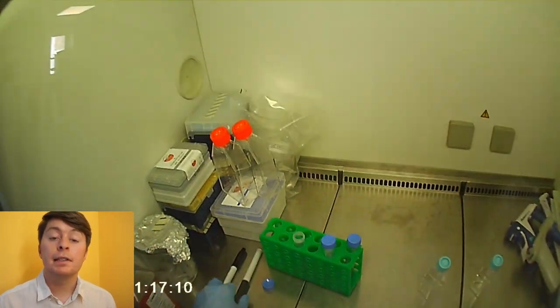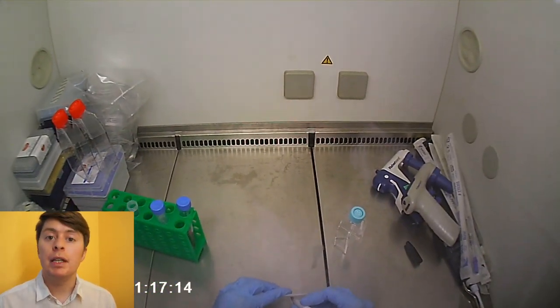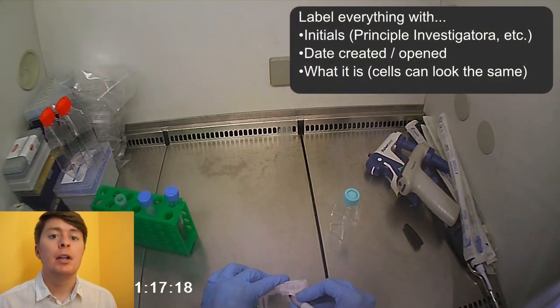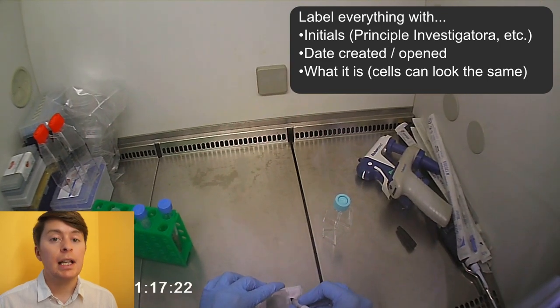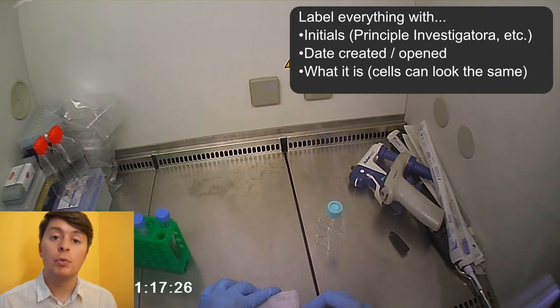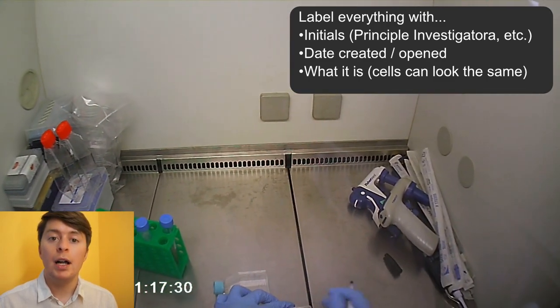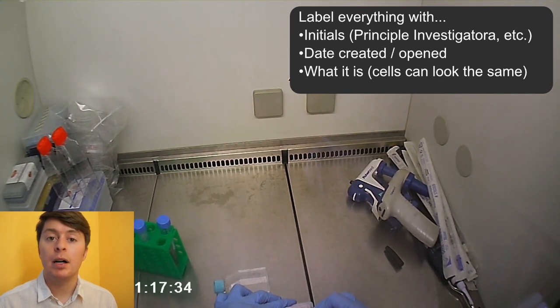So one of the key things as well is making sure that we label absolutely everything, be it our media, the fetal bovine serum, the antibiotics, the cells, everything. That's simply so that we can track where it is. And this is very important when you're working in a shared laboratory like I was, where there are many different teams working on different parts of projects.